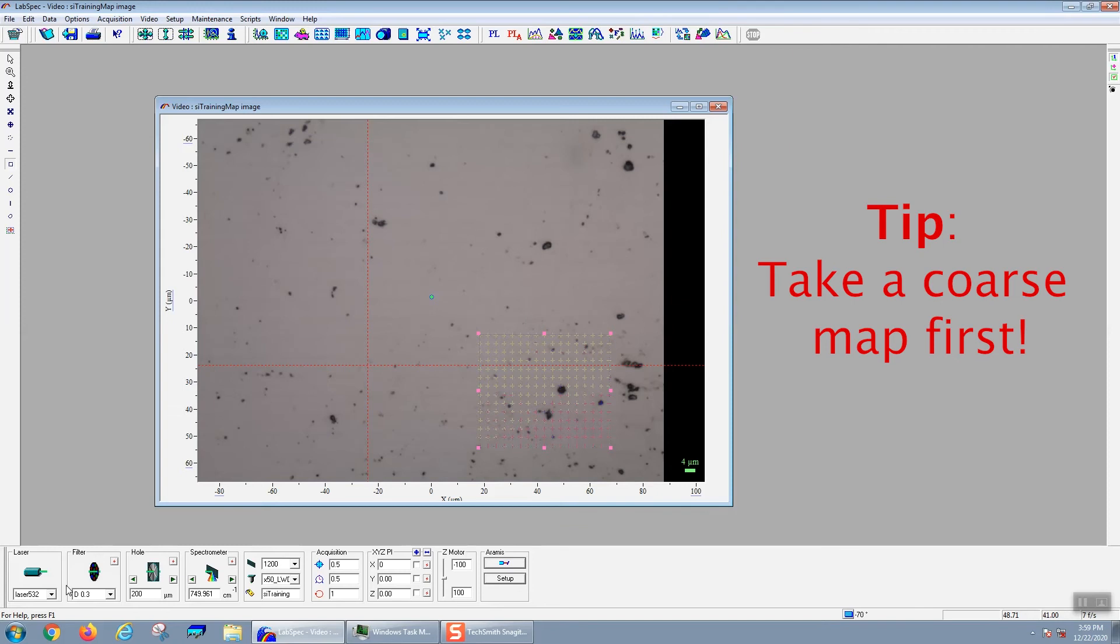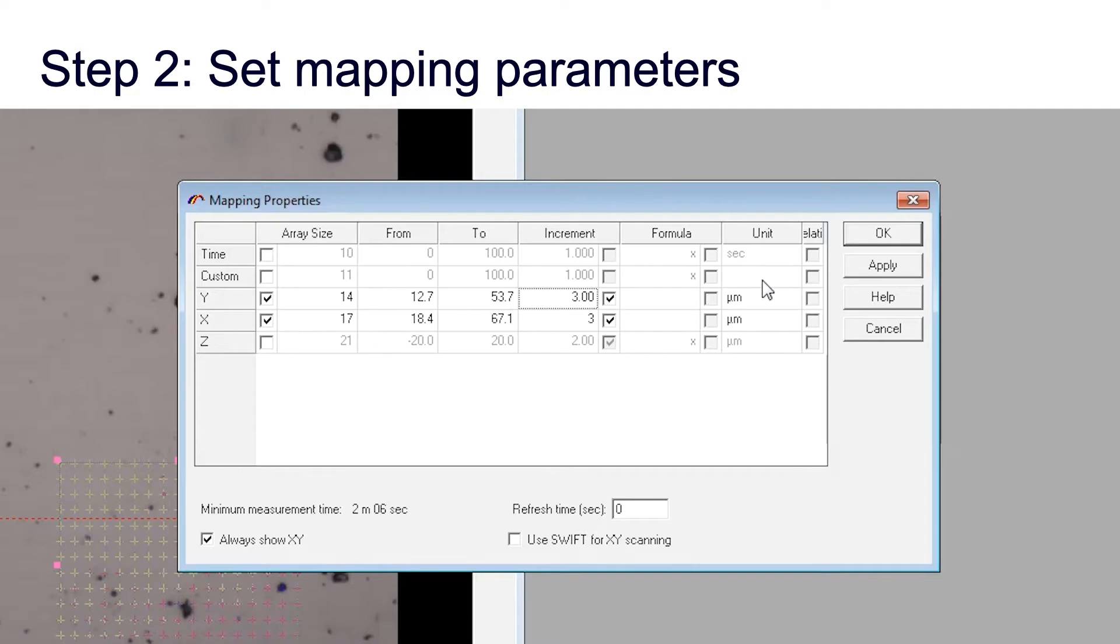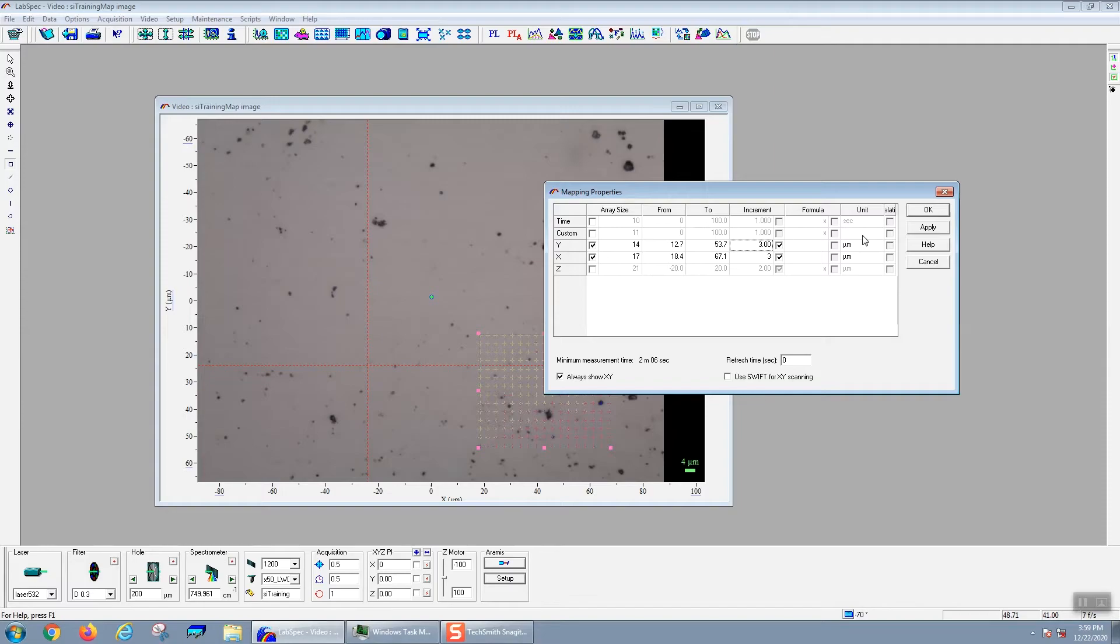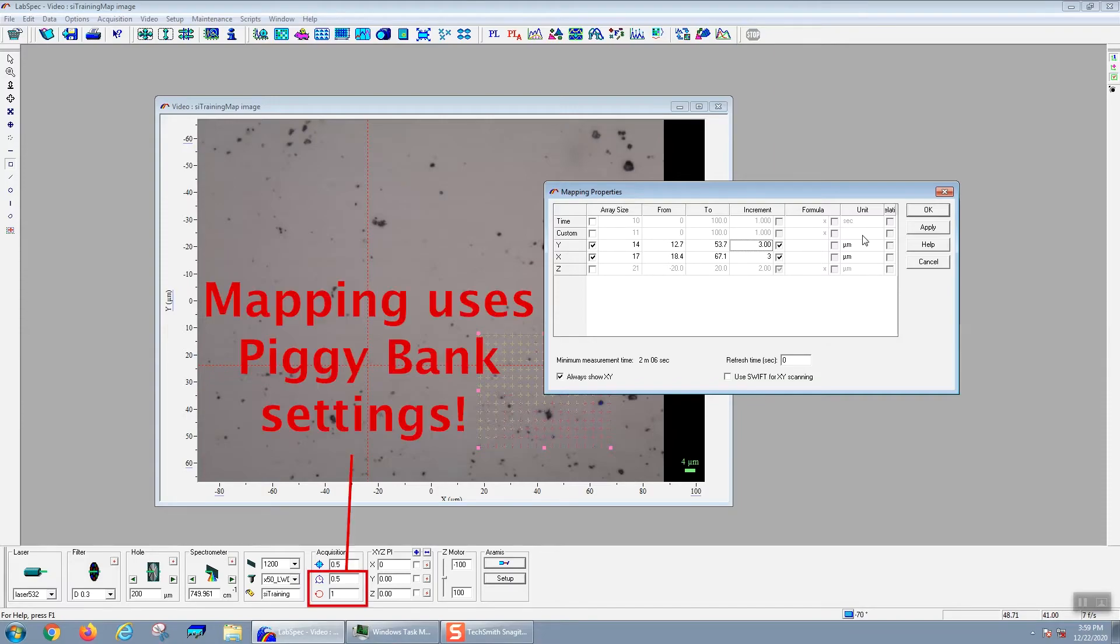I would recommend always taking a coarse map in the beginning so that you don't waste a lot of time taking a map that doesn't have useful information. You can get an estimate for the amount of time that your map will take by looking at the bottom left-hand corner, which has a minimum measurement time. This will only be accurate if you've already set your acquisition parameters, that is the parameters that you would use for your piggy bank spectrum.